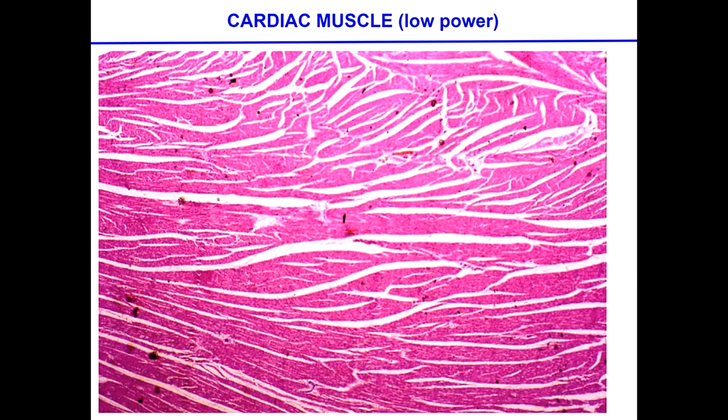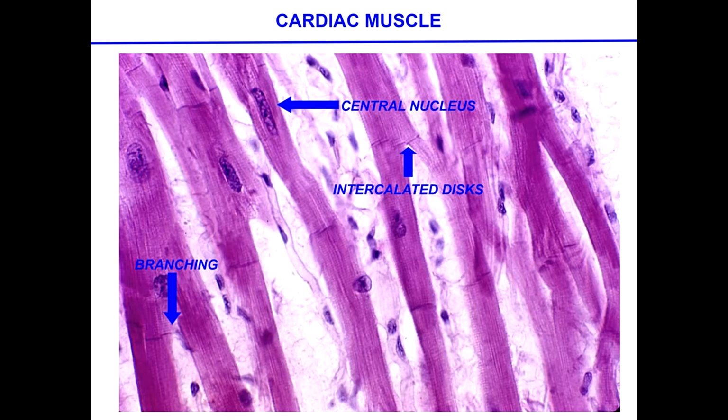By the way, if you look at this one and you don't find any nuclei, don't think that anything happened to this heart, poor guy. It's simply because it doesn't stain the nuclei. It just stains the cytoplasm or the sarcoplasm. In this case, everything is shown, and again, the main characteristics are these funny-looking, step-like structures in different positions that mark the separation between the different fibers.